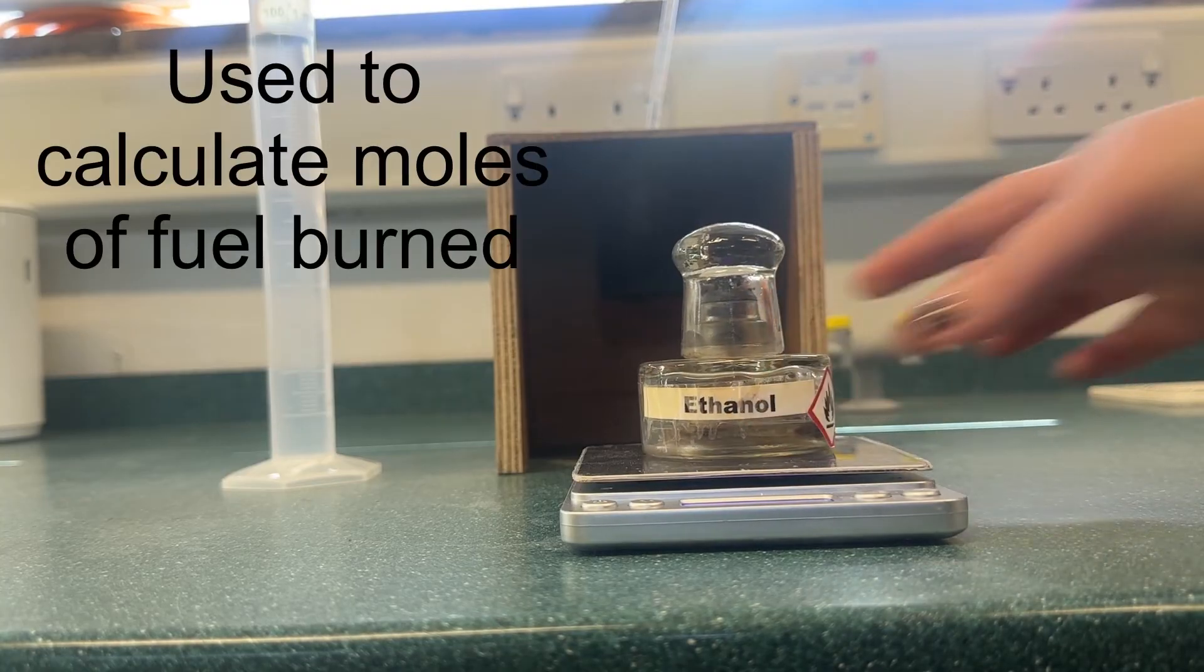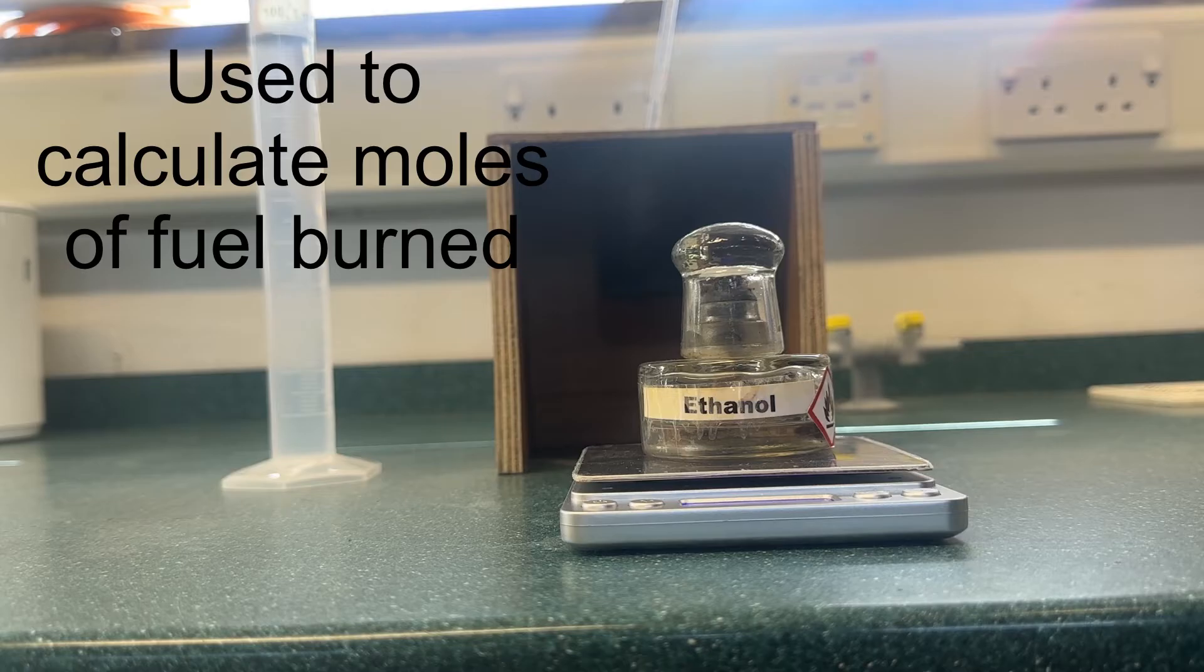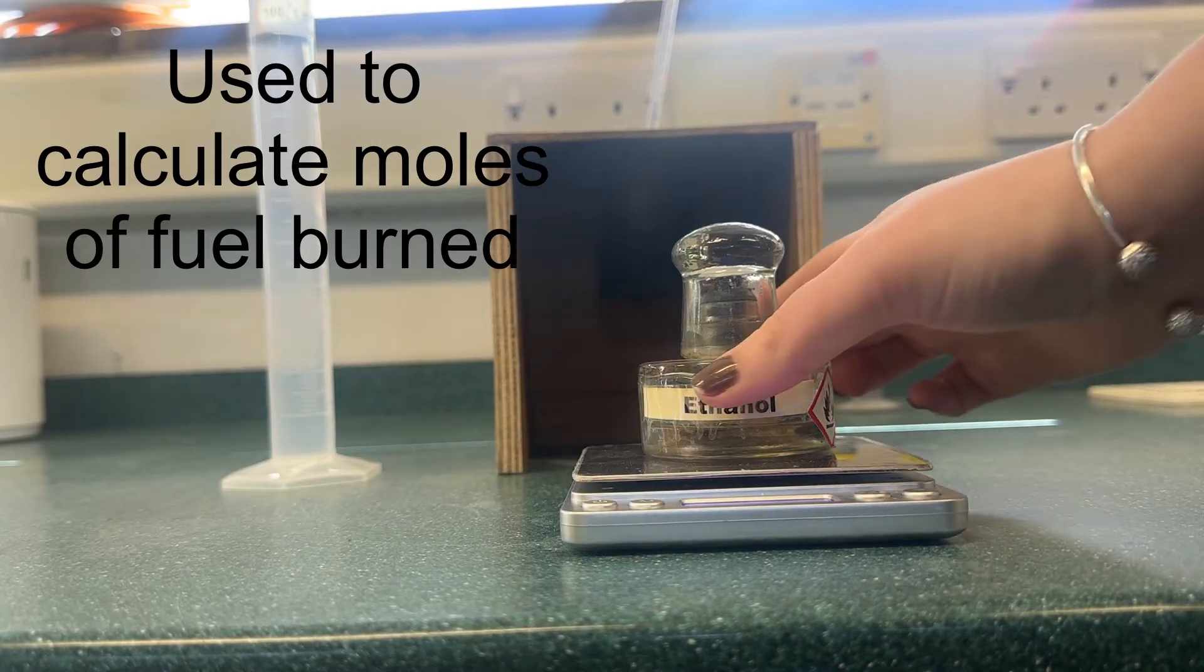The first measurement you need to take is the mass of the spirit burner at the start of the experiment. You need to do this with the lid on so that you do not evaporate any of the alcohol.